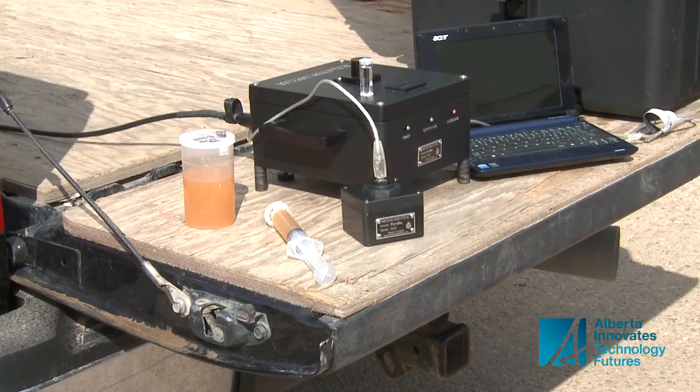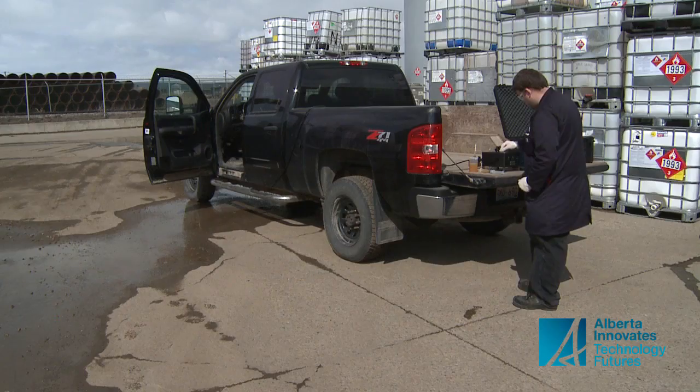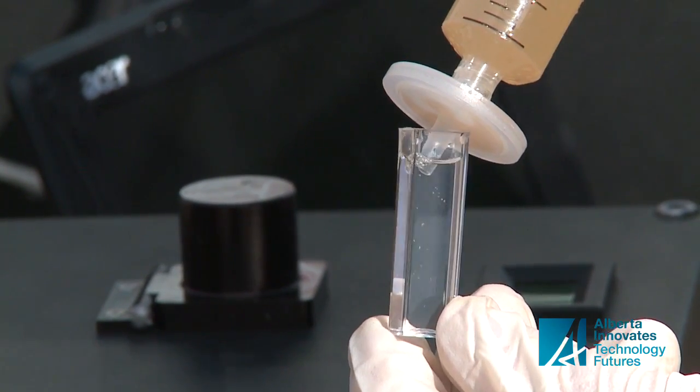Now equipped with the right technology, the quat box is starting to catch on. The big plus is samples can now be analyzed anywhere, even on the tailgate of a truck. That makes it attractive to Alberta's oil and gas industry.